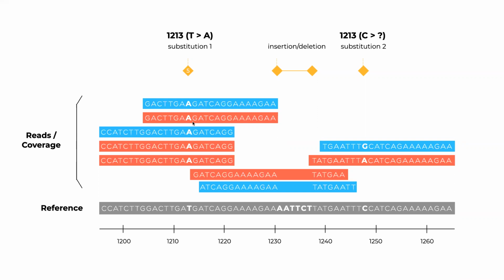Because not only does the sample represent a collection of cells, so really many different viruses together, but it also represents various types of mutations that it is actually impossible to clearly characterize just using next generation sequencing. So depth is very important. That's why you can see 2,000 reads mapping on those specific viruses. When we characterize viruses and want to understand all of the different mutations, we really need to pay attention to how many reads we have.